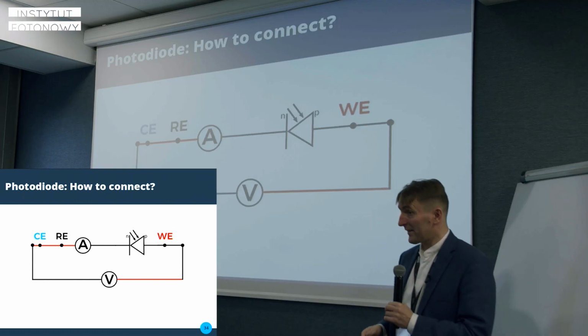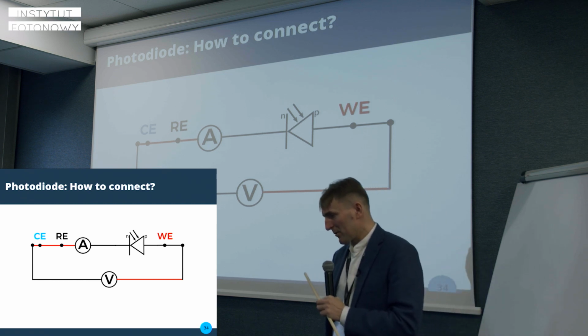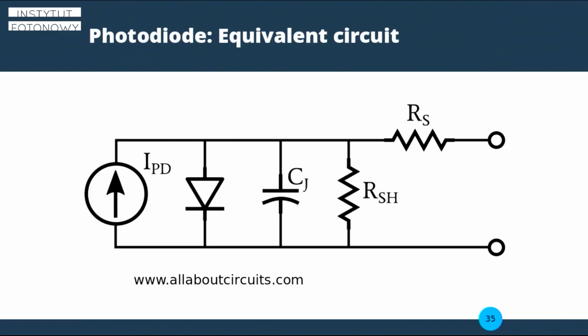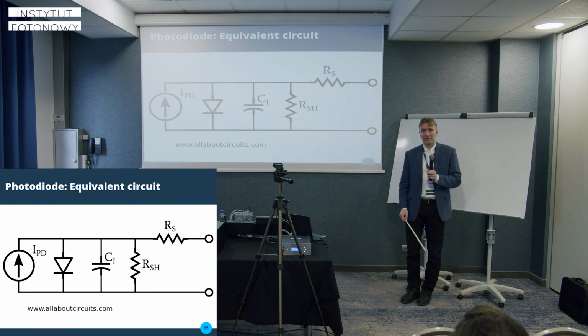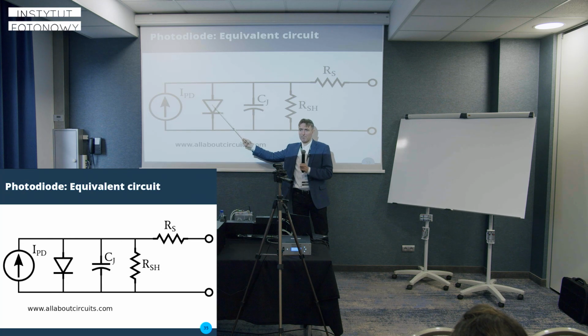Understanding the photodiode should start from perhaps this equivalent circuit. It is unlike the equivalent circuits that you will get from impedance spectroscopy, because it has a nonlinear element in it. This nonlinear element is a diode.